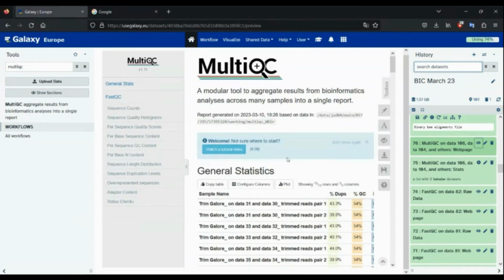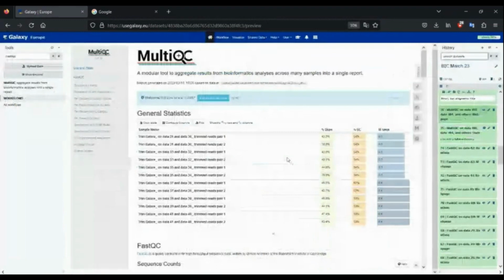Yeah, there we have it. MultiQC is basically the same thing as your FastQC output. It's just that it has merged everything together. When you have just a couple of data sets, say 2 or 3, it's easy to keep comparing them by opening each FastQC output, right? But when you have a huge number of files, because you can have up to 12 samples or even more, imagine you have paired-end sequences of 12 samples. So you'll have 24 outputs, and so on. Depending on the size of the data, MultiQC makes it easy for us to view all the results in one page.